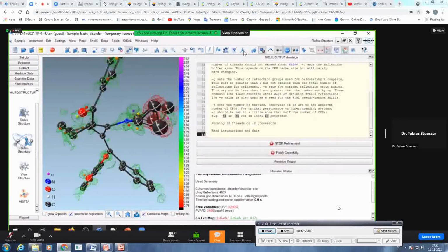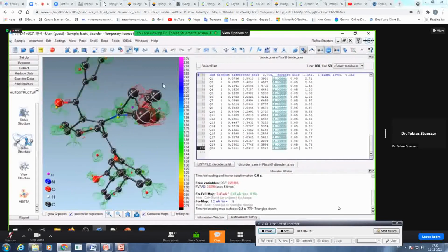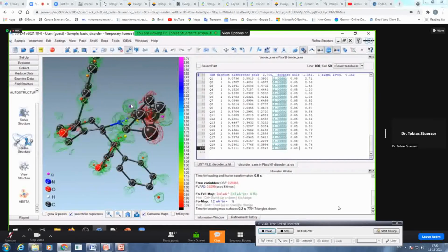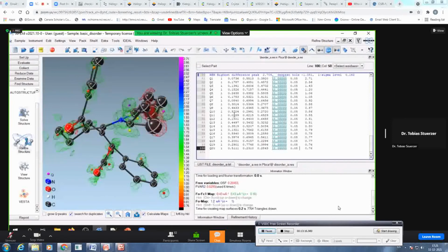We click here. And it improves already a bit. The positive density is gone here. The too much model density is gone now. And it sharpens the remaining density here. So now we can clearly see the second orientation of the second moiety.